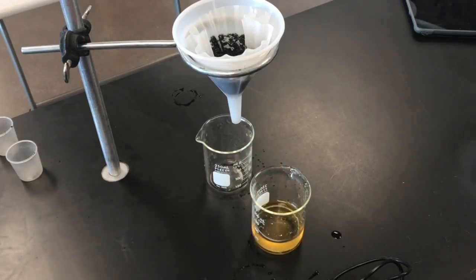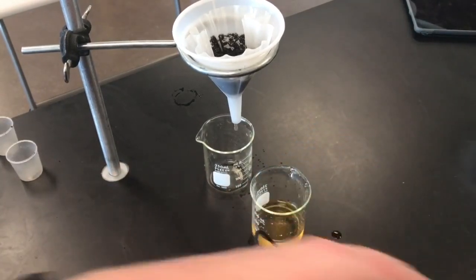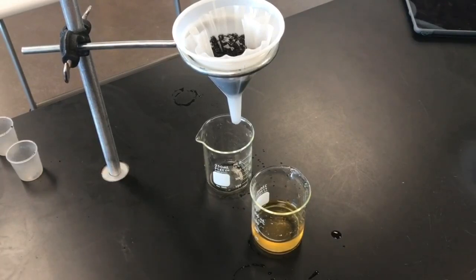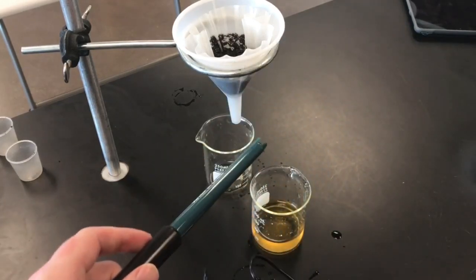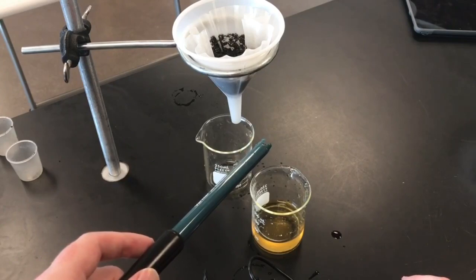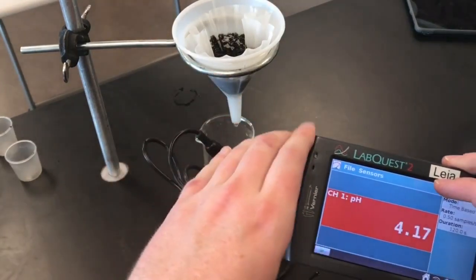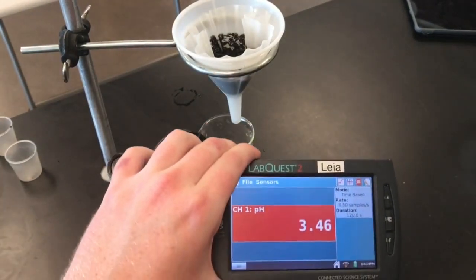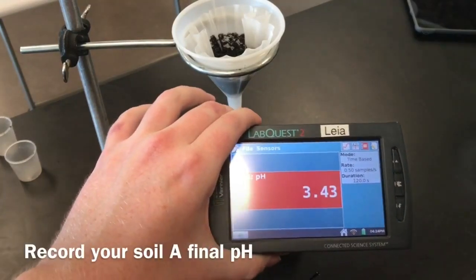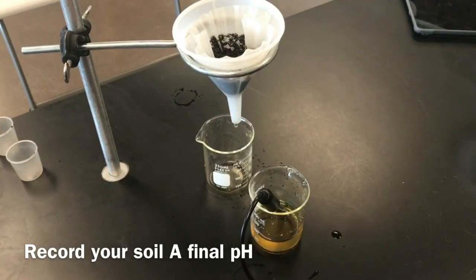So same process. I'm going to spray off my probe. Make sure to spray off your probe. Do that right now. And when you're ready, I'll let it sit in there. And it looks like my pH went up to 3.43. So this was soil type A.